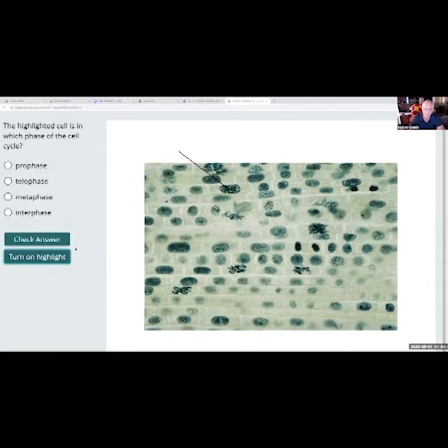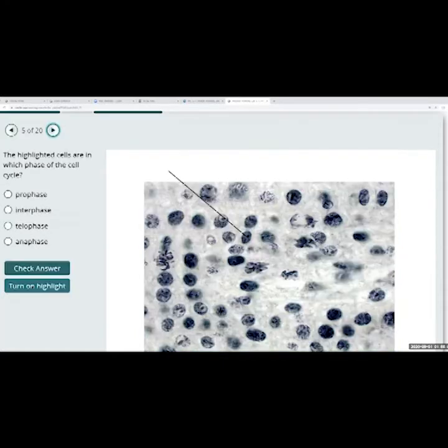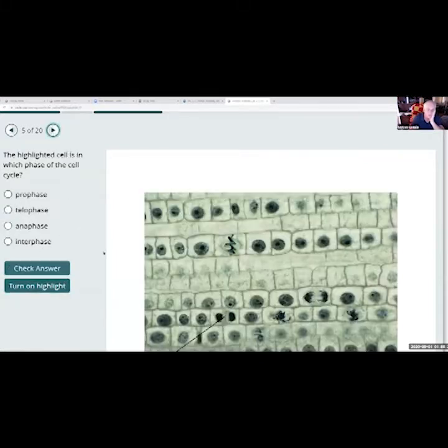These two slides are what? Prophase? Looks like prophase to me. Okay, is that better now? I'm catching up. What two slides are these? Interphase, right? Everything's spread out. Nothing's condensed yet. I'd say interphase too. So far, we agreed with them.